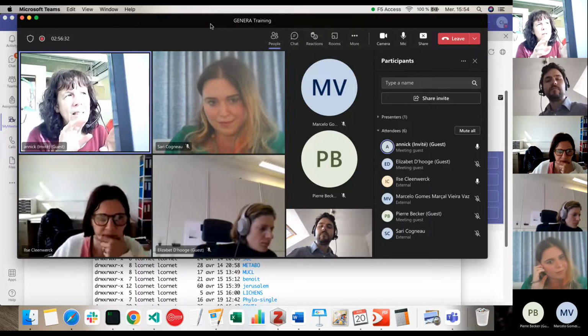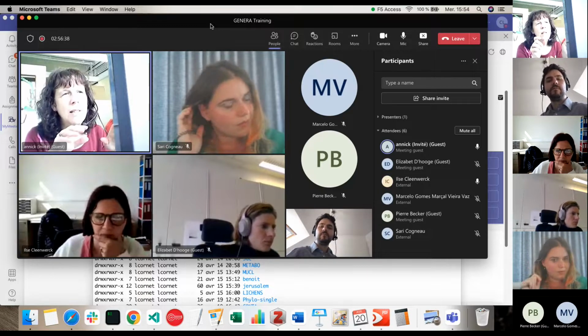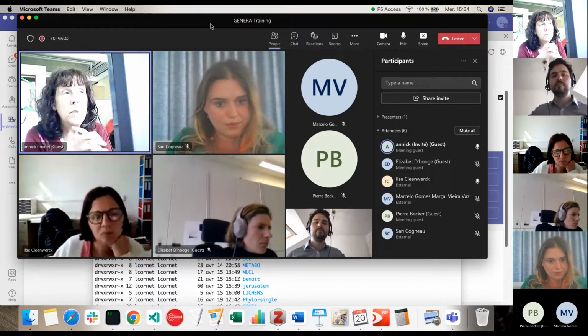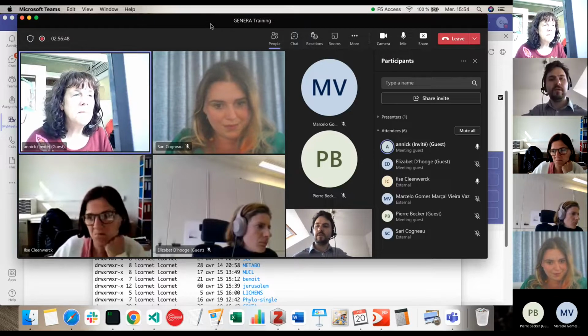If you take all the genomes, I guess it's a bit like a patchwork, and so they keep only 10% apparently. Okay, that's interesting. I will read it.